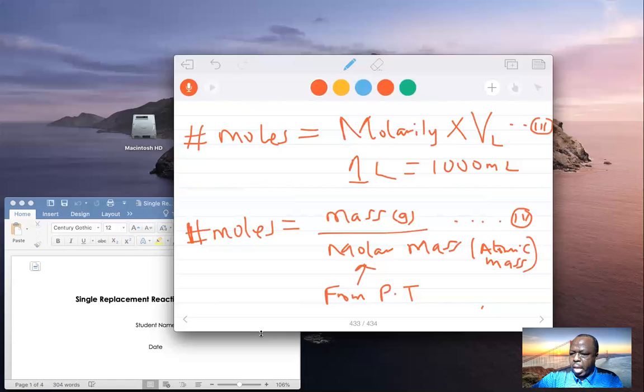If I can weigh using the balance, you should have a balance similar to what I have in my hand. I know you may not see it, this is a balance. I know you have something similar to this, which you can use to weigh your reagent. So these are the 2 reagents we're gonna be using. Now, having said that, those are the equations I just gave you.